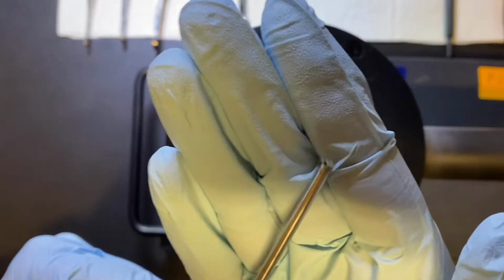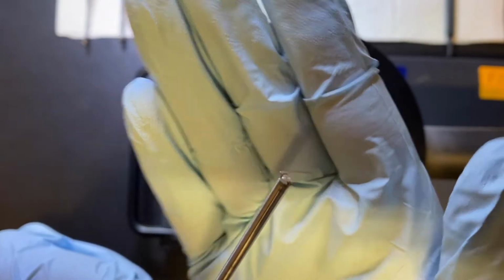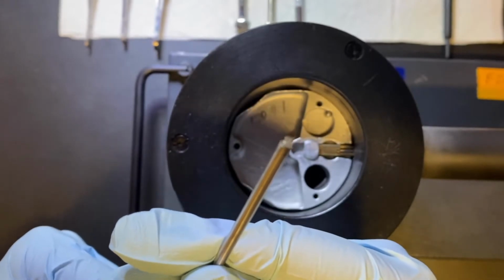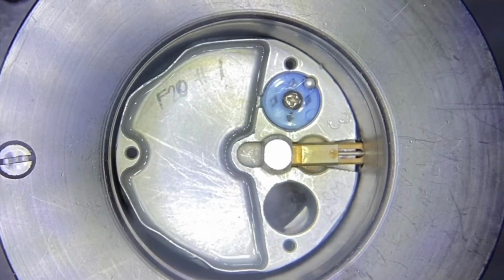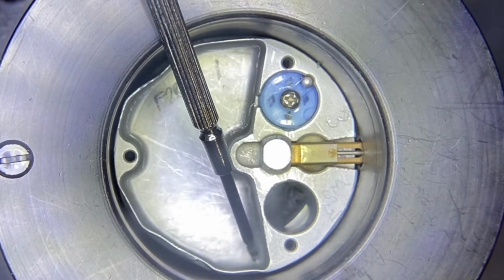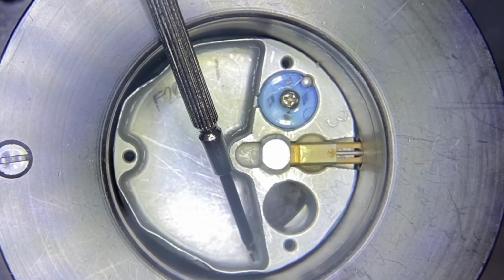Our clip ring butterfly tool is used to grip the clip ring of the holder. It has 2 states, the open and closed. We just twist the knob at the bottom to change positions. Let's start by cooling down the screwdriver. We'll know that it's cold when boiling stops.